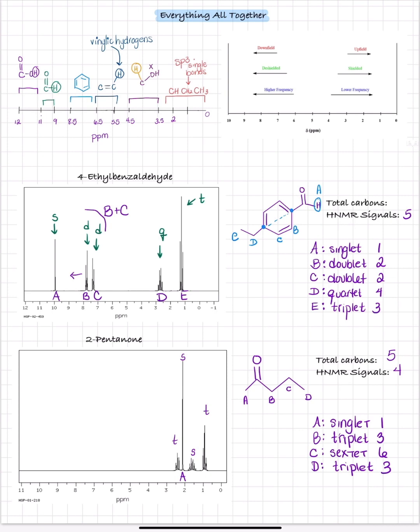Well, I have 2 triplets in this case. B is also a CH2. This CH2 is normally located here, so you would just assume that it would be this triplet. But remember, it is still connected to that carbonyl, which will force it more downfield, which actually makes B your last triplet located closer to 3.